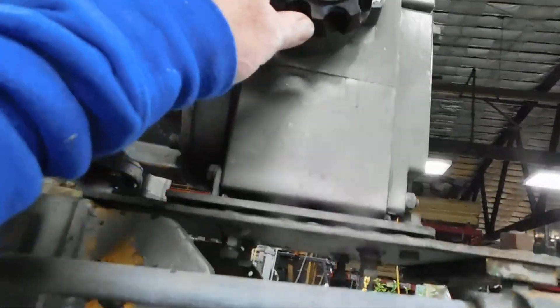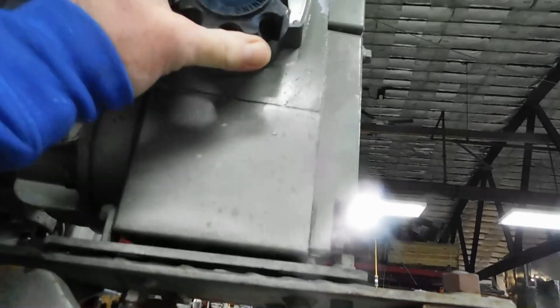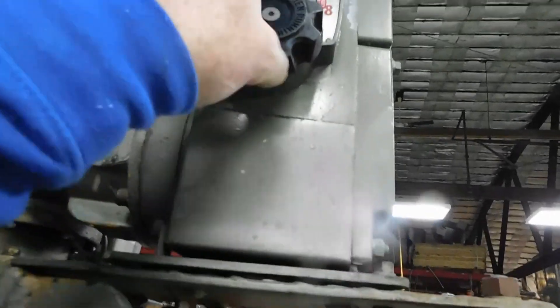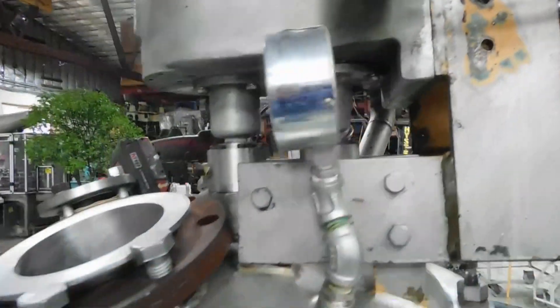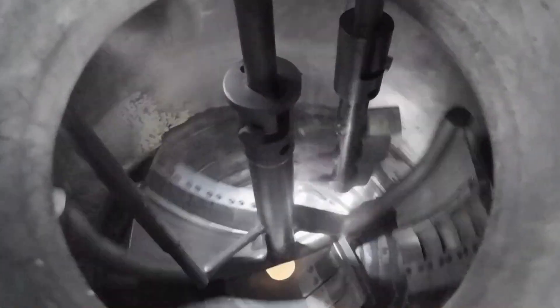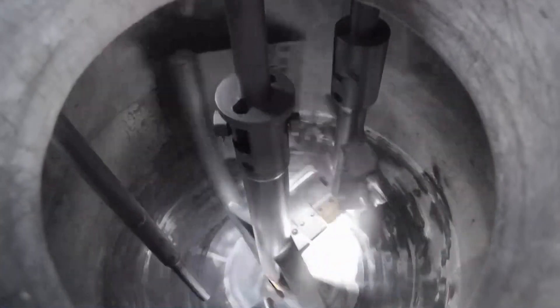Simple variable speed control right here. Speed you up and speed you down. It will slow down to almost a crawl, up to about 25 RPM.